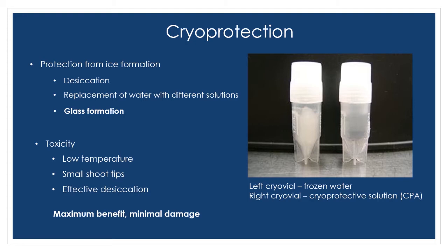So you can see that all the steps leading up to freezing are really important and have to be optimized before we go on to freezing. But if everything is optimized up to this point, hopefully our tissues are well enough prepared to survive the next step.